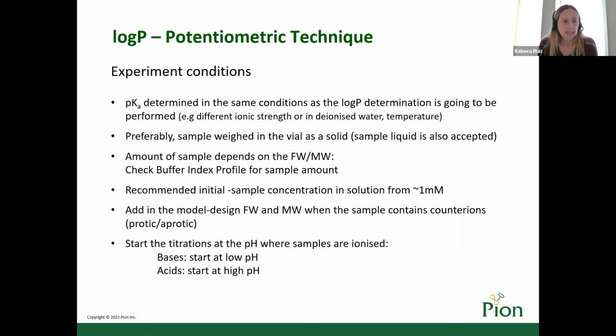The model design needs to include the formula weight and molecular weight with all counterions present, the aprotic and protic. Start the experiment where the sample is ionized. That will be low pH for the bases and high pH for the acids to help dissolution.